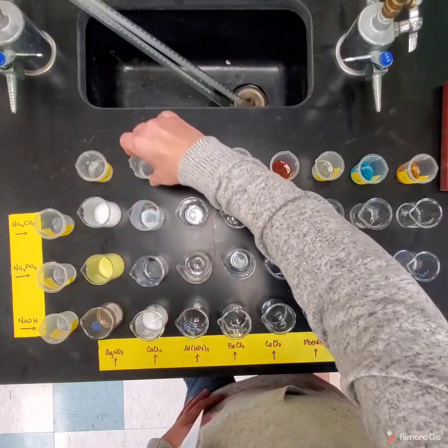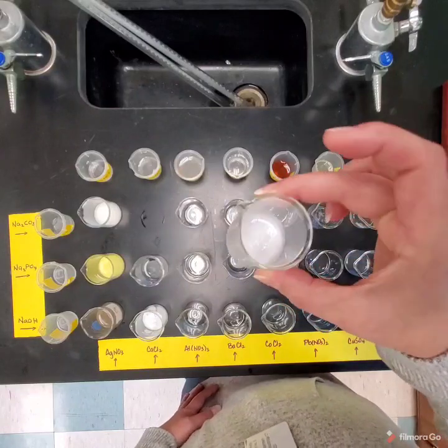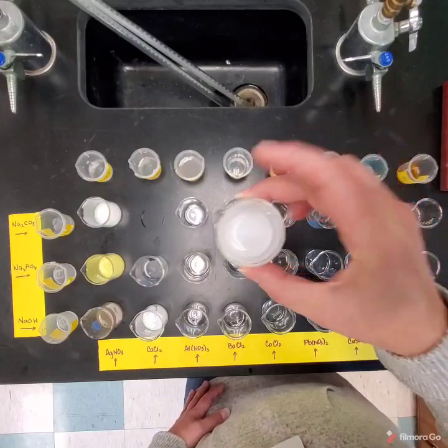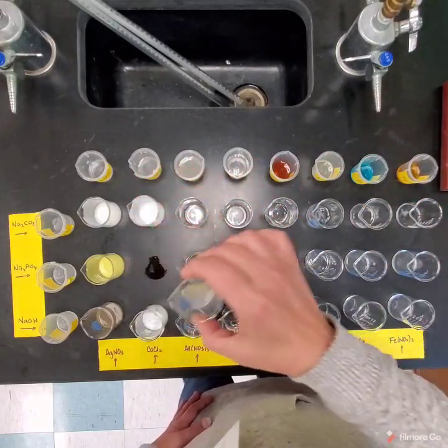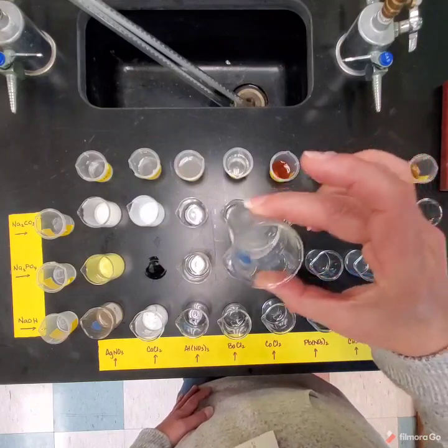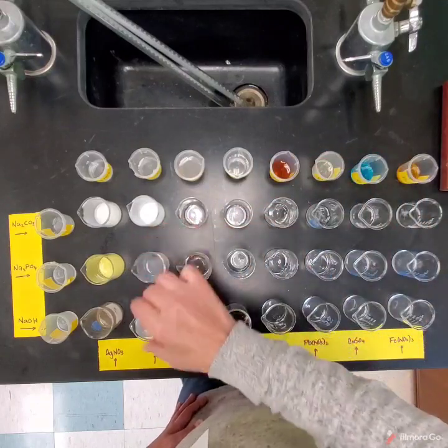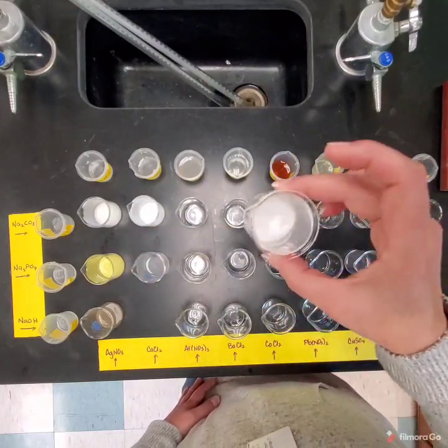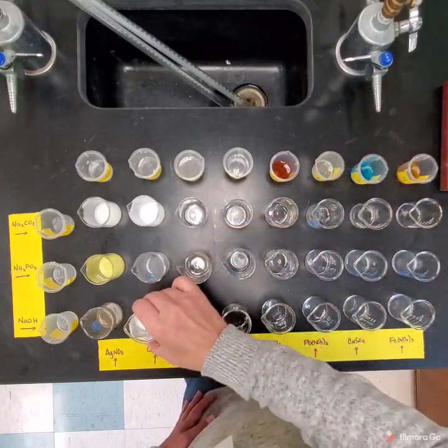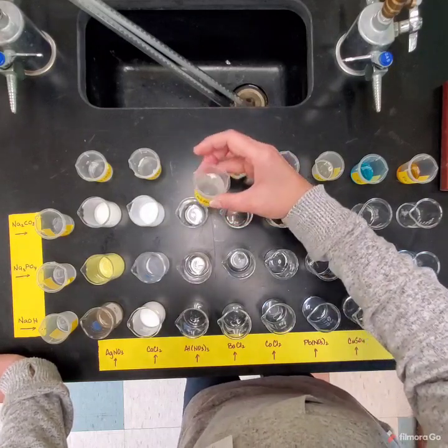Now each of these precipitates can be kind of clumpy, can be kind of gel-like. I don't know if you can see this one, but it's a little goopier, it's thicker than the other one. They can be powdery. Okay, this one you can see it's a little bit forming, and this one's a little goopier as well. And this is one that would be powdery. See, it's still sort of liquidy, and if we let it sit, you're going to see the powder sink to the bottom. All right, this next one is aluminum nitrate that we're adding.